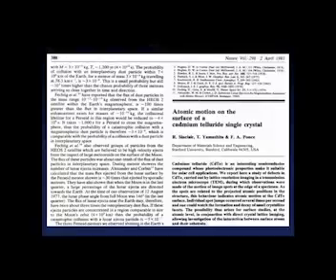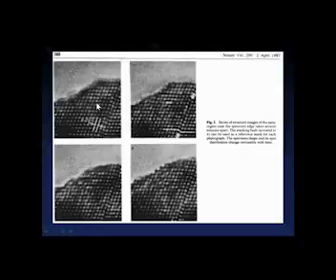Around the same time, a group at Stanford University utilized a medium voltage electron microscope operated at 120 kV, and they reported the observations of atomic motion on the surface of a cadmium telluride single crystal. Since the microscope was a medium voltage microscope, 120 kilovolts, the sample used was much thinner, and a lot more structural detail could be resolved from such thin samples. What the Stanford group observed was individual bright spots moving along the edge of the cadmium telluride sample over time. Jumps would occur several times per second, usually corresponding to the atomic separation between the 111 planes of cadmium telluride.